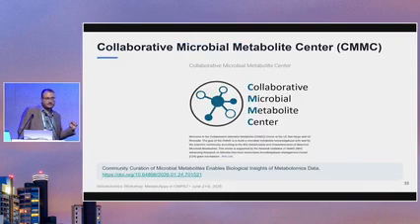Any doubts on that? As I mentioned, it's a lot of detail that you can go to look at that data. It's just an idea for you to be aware of those tools, to try that. Of course, you can send us questions later and to discuss that, to suggest other implementations, other ideas that you have. So it's really just, as I mentioned, an overview for you to be familiar with those tools, what can be done with that, and to, of course, collaborate with your own data, to make it public and to use it as part of the repository idea.